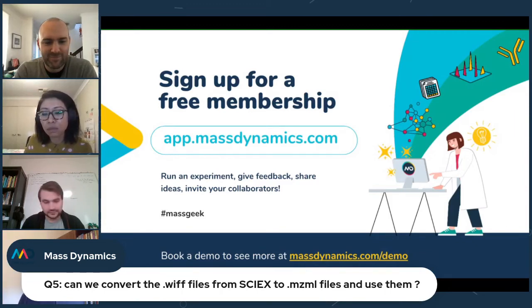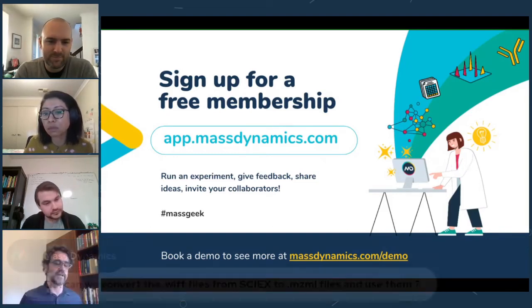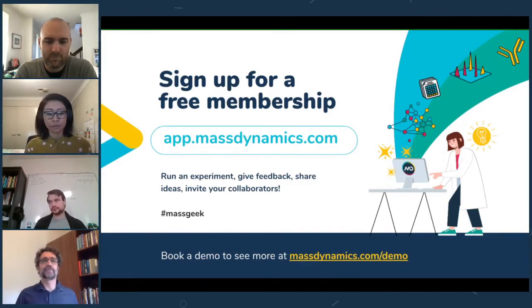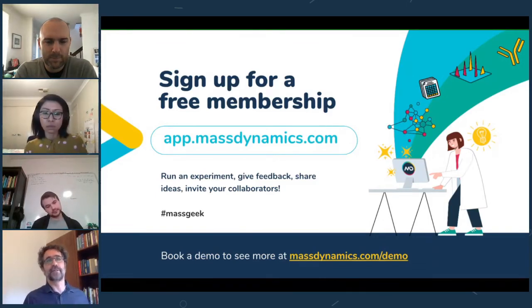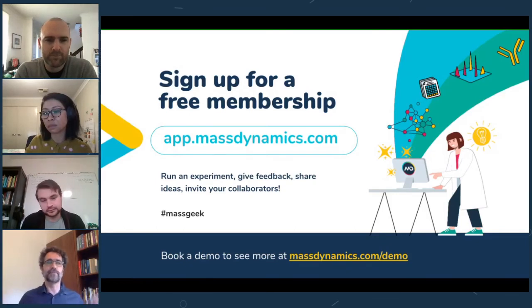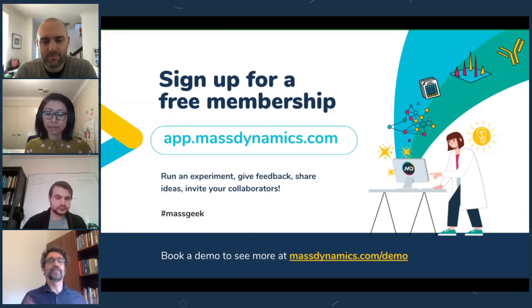Not yet either. The question is not really about converting one into the other. It's more about the algorithms behind. At the moment, the ones that we have are very tailored to high resolution Orbitrap data. We're moving to expand that into using different types of data, like TOF data. So as soon as we can do that, it will be either WIFFs or mzMLs, depending on what we can do. But it's more about the algorithm behind and the instruments.